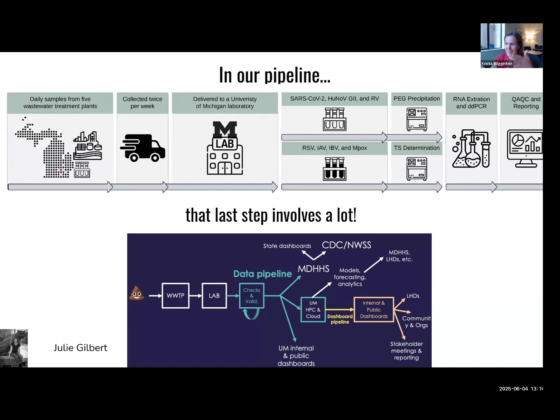But what I wanted to really focus on here is this last step, the QA/QC, and then the reporting, and how much that last step really involves. And many of you know this. So we've got the lab part, but then in our program, we've got all of the checks and validations that happen with our raw data. And some of that then goes to the state.